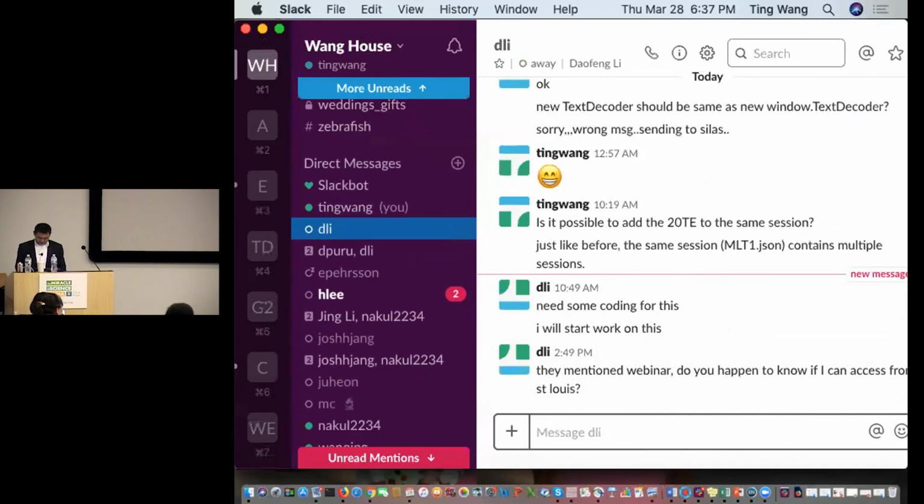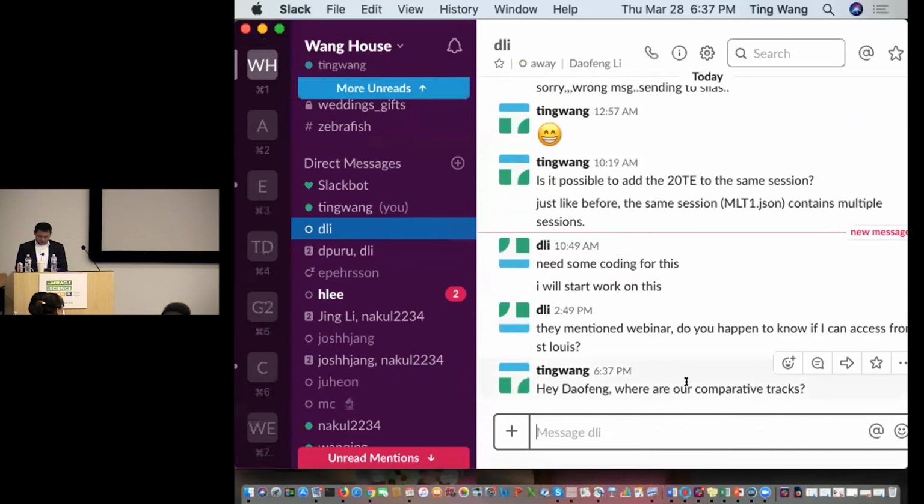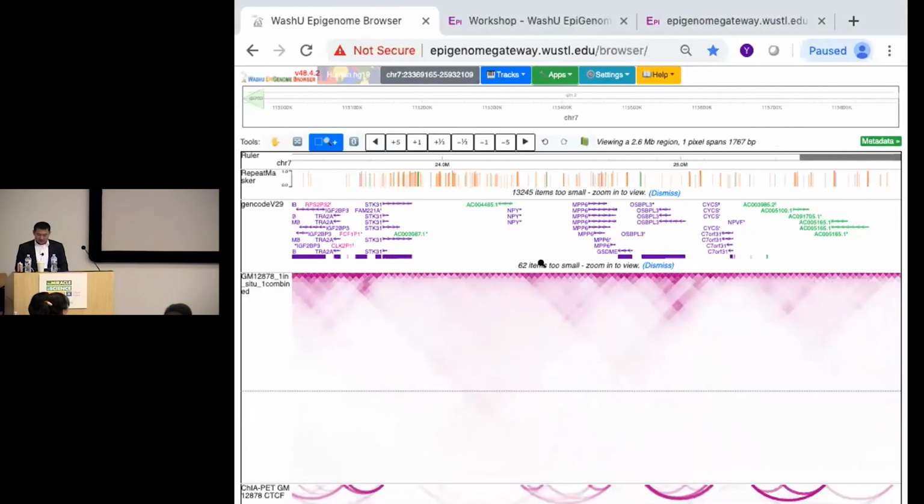It's probably after hour. Where is our comparative track? That is the favorite, guys, that you should remember. Genome alignment. Oh, we call that the genome alignment track. Yeah, well, it's 6:30 there. They've probably just left.